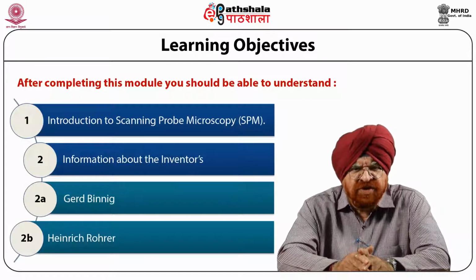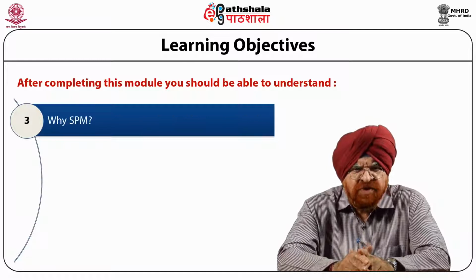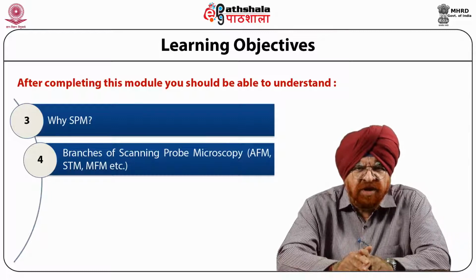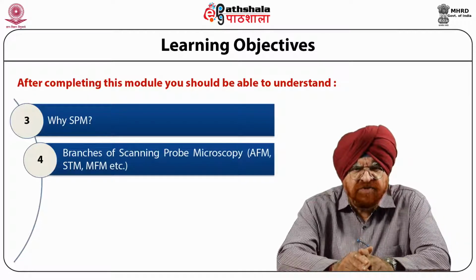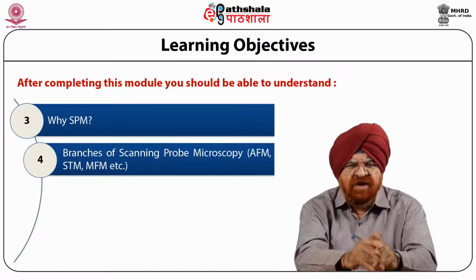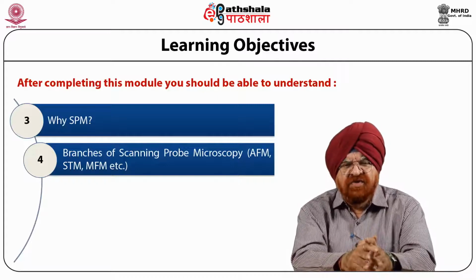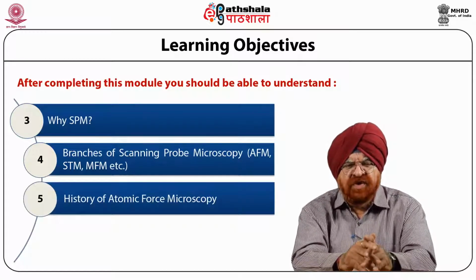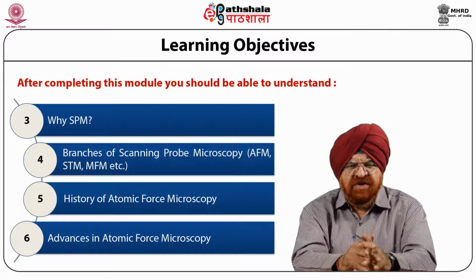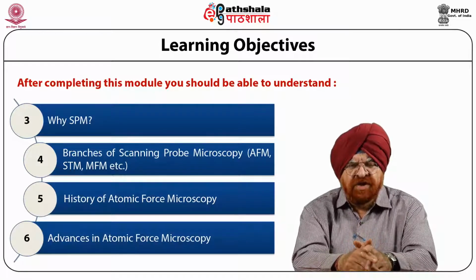We'll continue with why SPM? Branching of scanning probe microscopy: it's a branch, but techniques like AFM, STM, MFM, etc. all will come under this category. Then, what is the historical background of atomic force microscopy? And lastly, the advances which are there in the AFM technique.